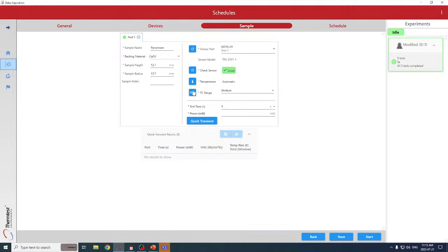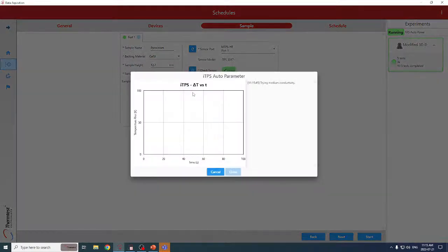So let's run that. That does take a couple minutes. But while we're waiting for that, we'll switch and we'll show you the progress of this and continue the measurements and show you the data. We'll switch to the MP2, which is our portable version, and show you that experiment while this is running. So we're going to switch camera.